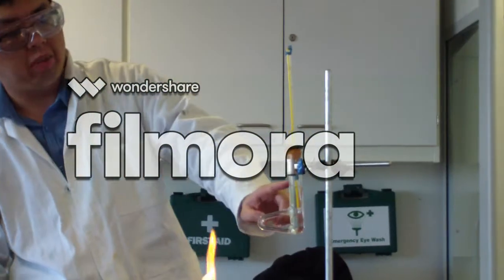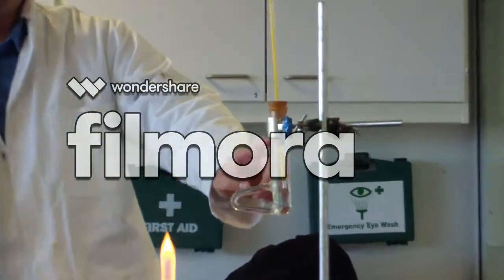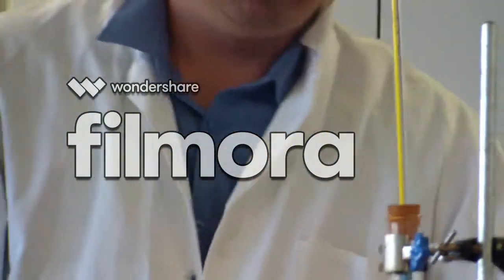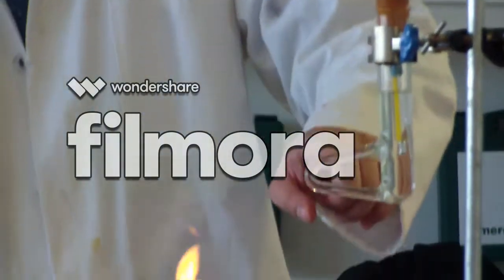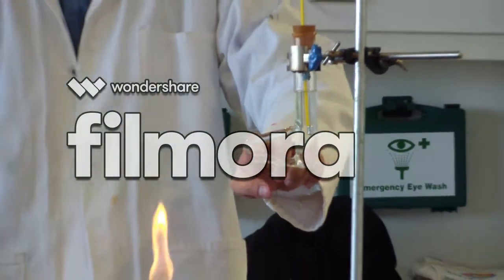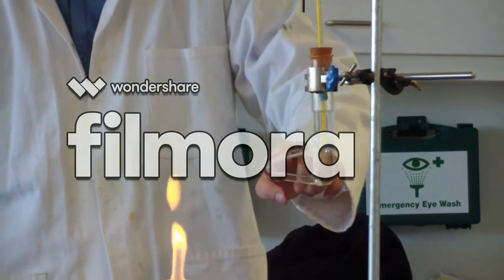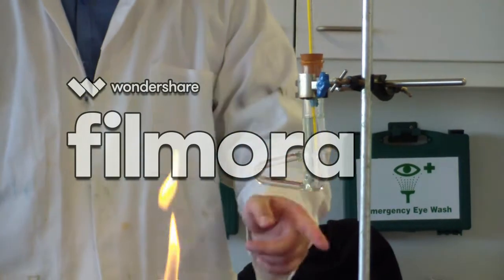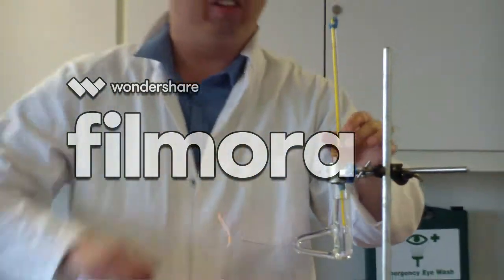You don't want to fill it up to the top with glycerol because of the pressure that builds up once it starts heating up. The way this works is you heat up this corner of the Thiele tube, and then the heat will circulate around, so you see the temperature of the melting point.